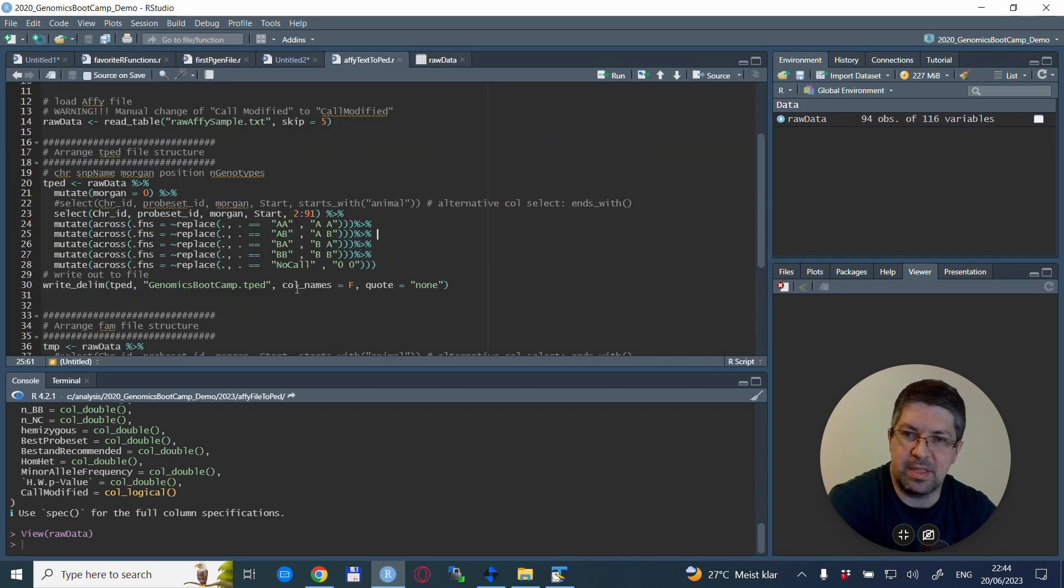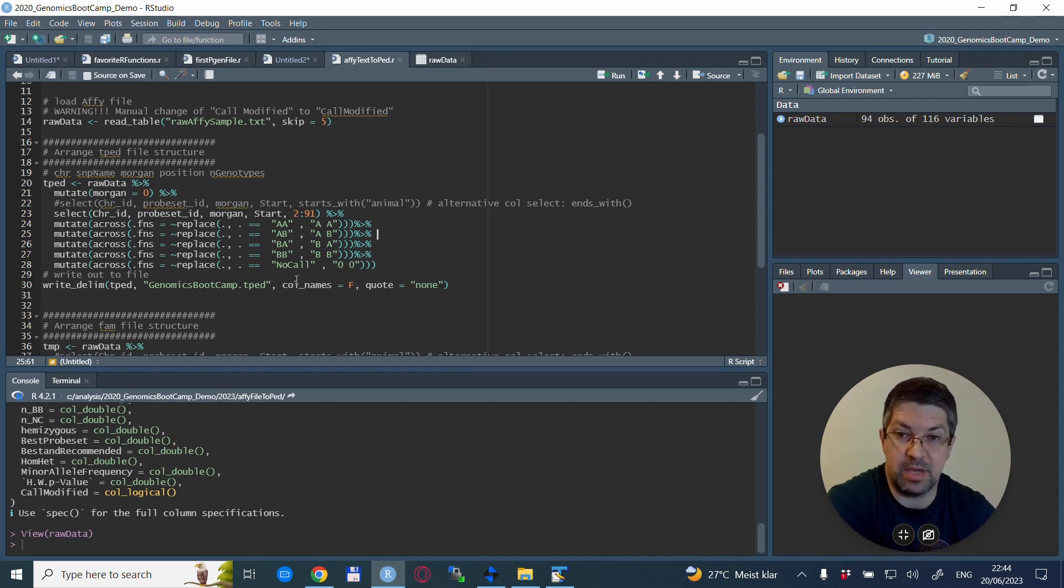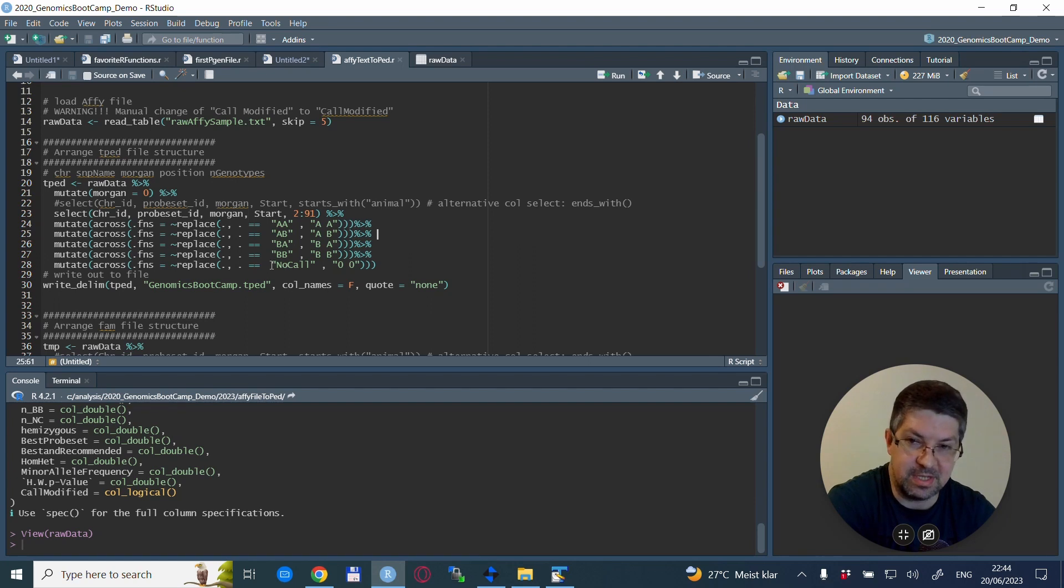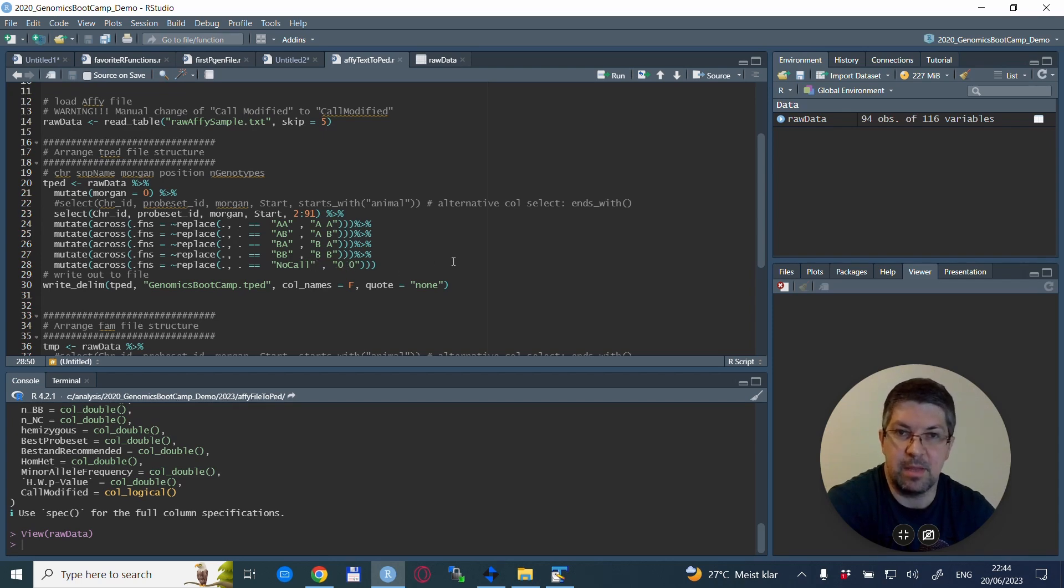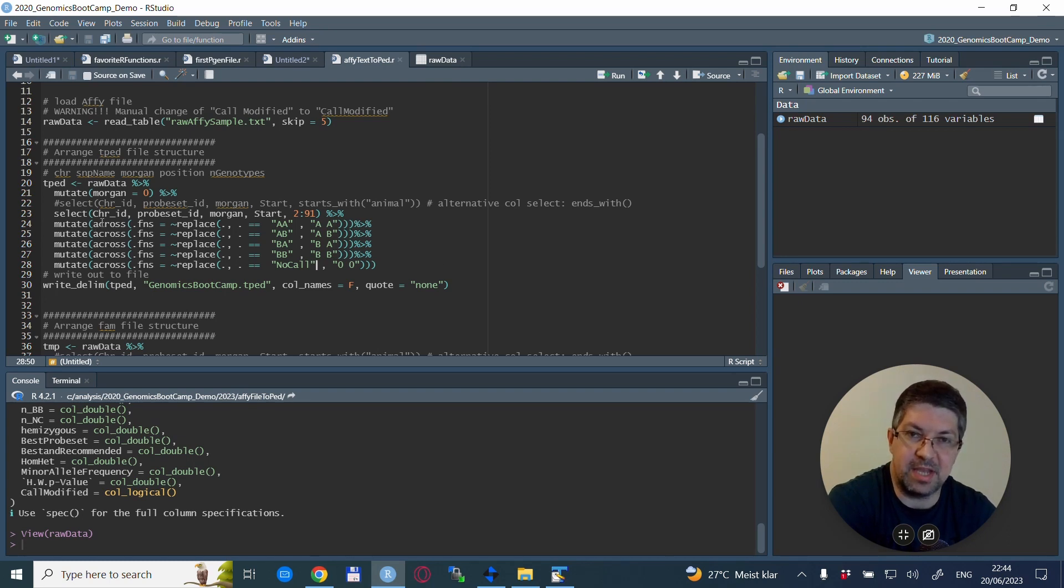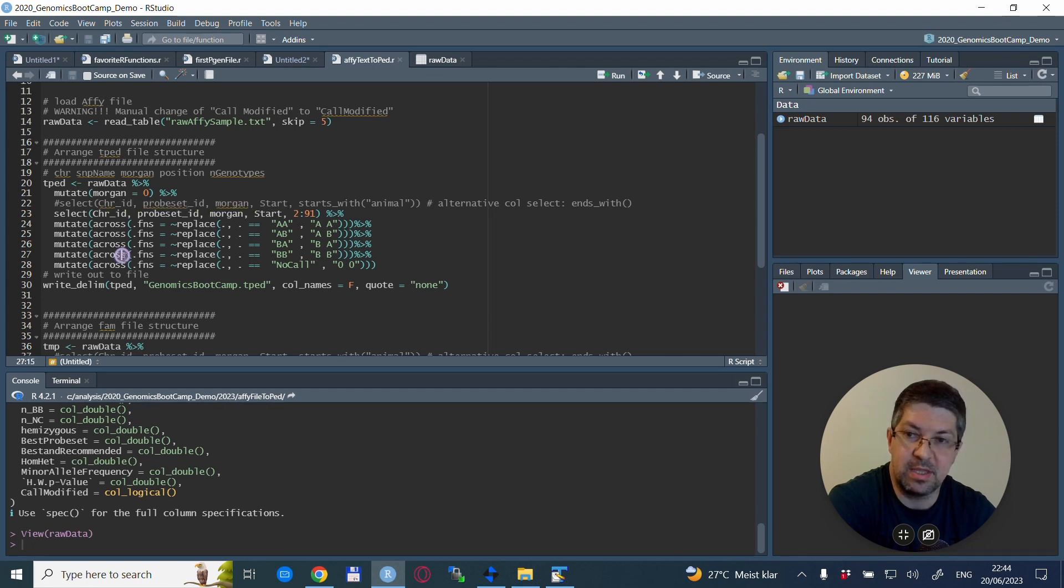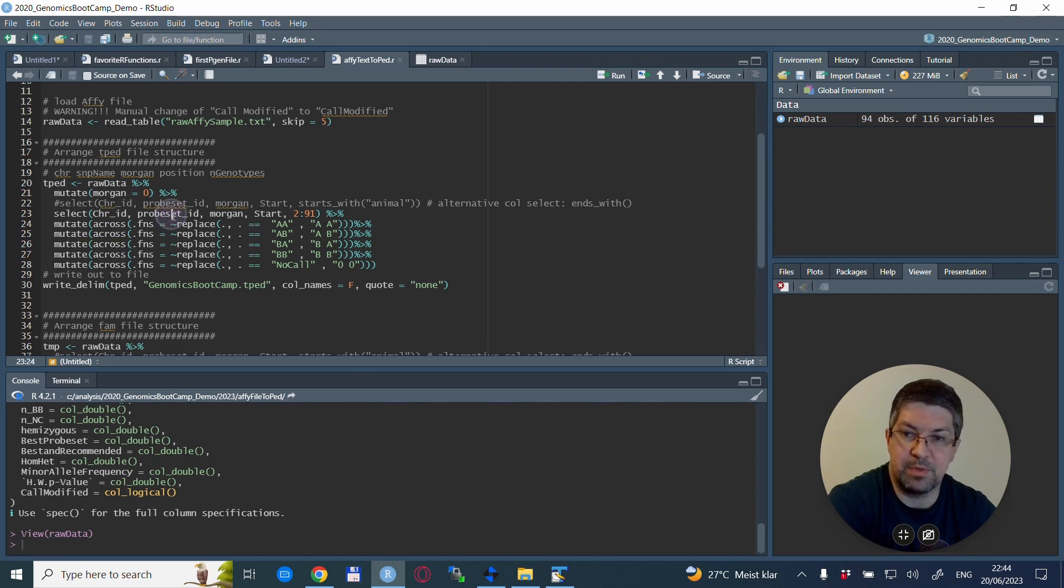So what we do is we replace them with exactly the same, just with a space in between. So this is what we do, and we replace columns number 2 to 91 with these mutate statements. In my case, in this very specific case, it's 2 to 91 because we have 90 individuals. So we start at column 2 and then we end up with column 91 here. So this is animal 90 and column 91. These we need to replace accordingly.